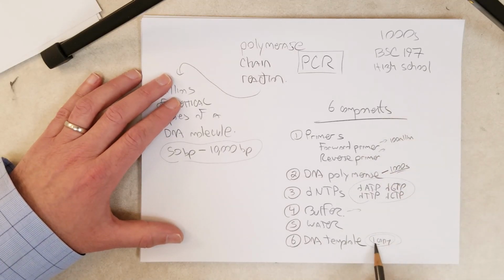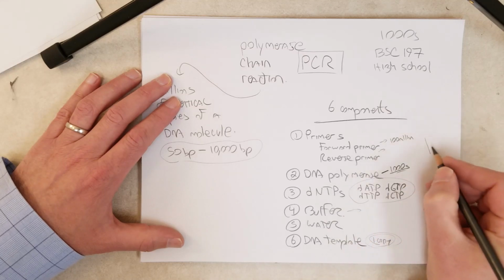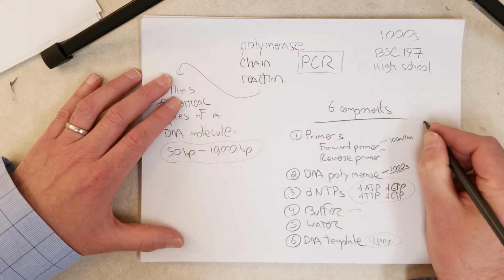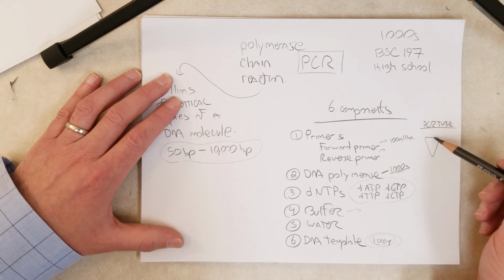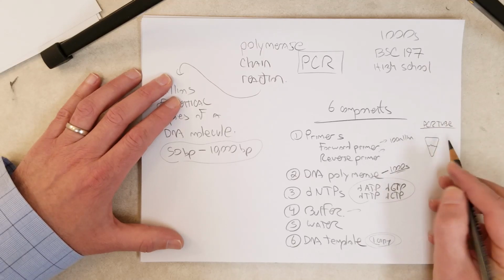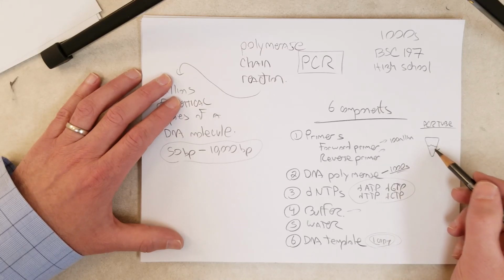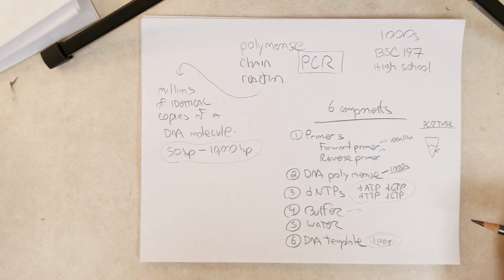But the DNA template is found in low numbers, and the goal is to make many, many copies of the template, or at least a part of the template, the part you want to copy. And we're going to do all of this in a PCR tube. And these are small, tiny tubes, and you can check the notes, I have a picture of one. They hold about 200 microliters, so 0.2 milliliters of liquid. And down here in this liquid, we have our water and buffer. That's where we'll have all of our primers and our template and everything. And the reaction is going to take place inside this little tube that we will put into a PCR machine.